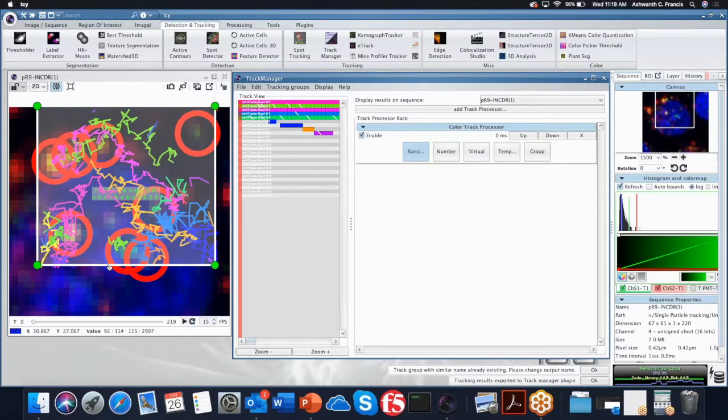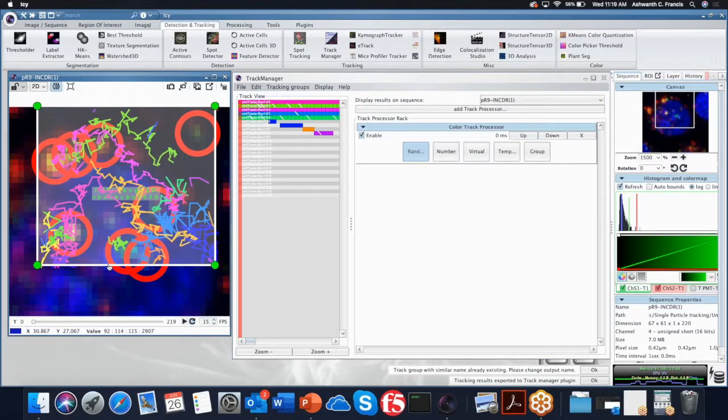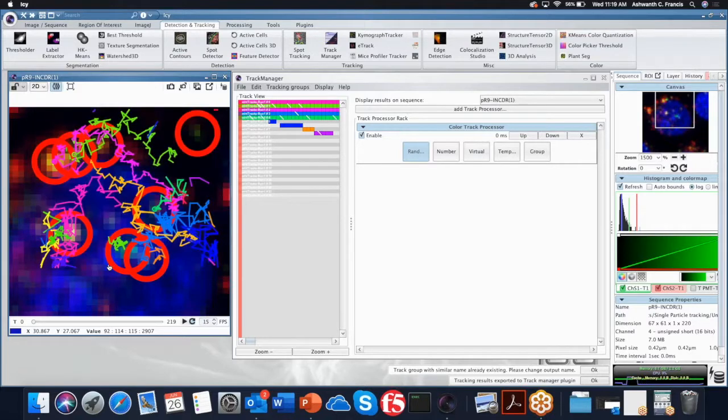You're probably not interested in all this bunch. You want to see one by one, okay? So you can just delete this ROI by clicking on the ROI and saying delete. Do you see what I did? I went back to the image, and I just removed the ROI that I had on my image. Have you guys done that? Yeah? So once you've done that, now you're safe, okay?